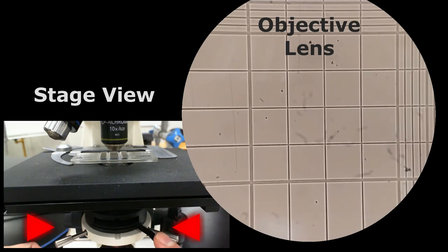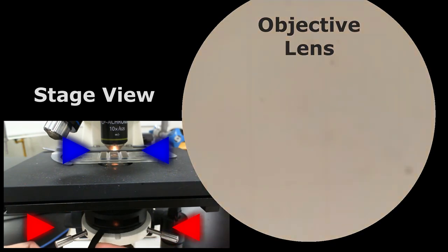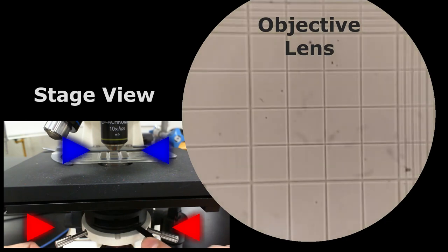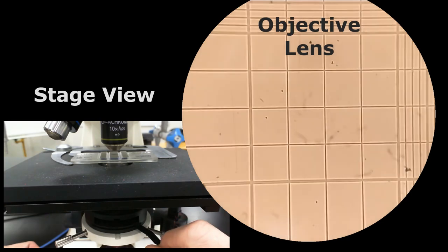Again, this closes off the condenser iris diaphragm. As you can see, if you look just at the light passing through into the objective lens, more light is passing through this way, which decreases contrast. As we move the slider back across to the right, it's closing off, and as it's doing that, it's increasing the contrast that you can see here. That's what we're looking for when you are using these slides.